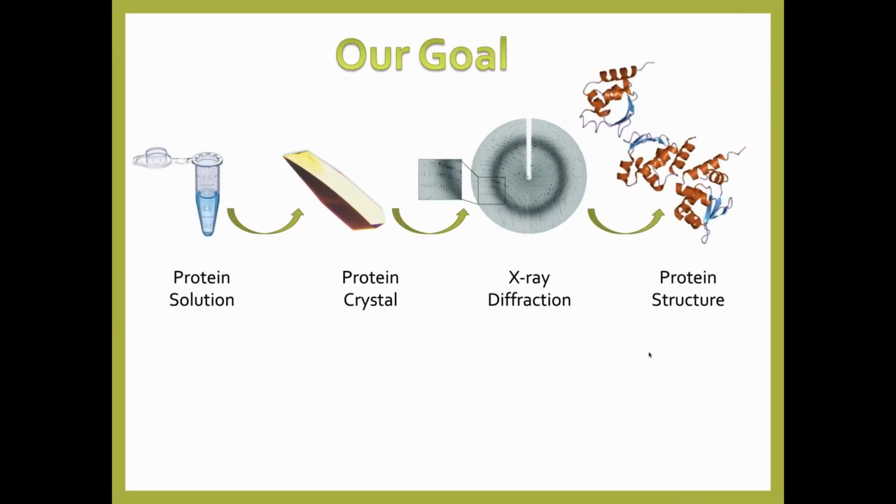Our goal at the TCSB is basically to take proteins from solution and solve their three-dimensional structure. We have various projects coming from both academia, the Technion, other institutes and industry, including the medical school at the Technion. Some of these labs are crystallographers, some have no structural background at all, and therefore there's a different level of assistance we give to different projects.